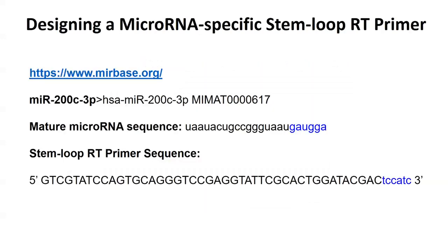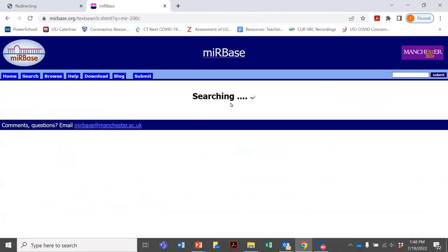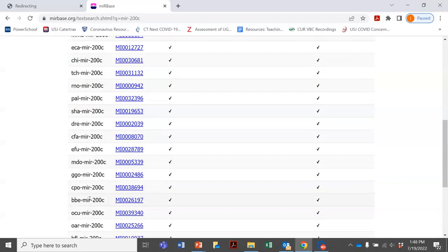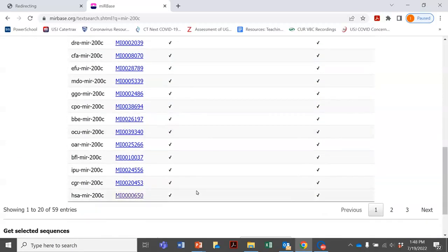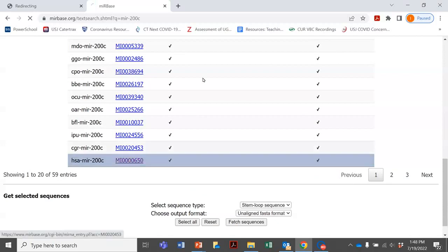To design the primers, the first step is to go to the microRNA database known as MIRBASE. You type in your microRNA of interest — for example, MIR-200C — and click go. You'll get a list of MIR-200C microRNAs across all different species, since this database is not just specific to humans. Scrolling down, you can find HSA-MIR-200C, where HSA stands for homo sapiens, which is the microRNA of interest when working with human cancer cells.